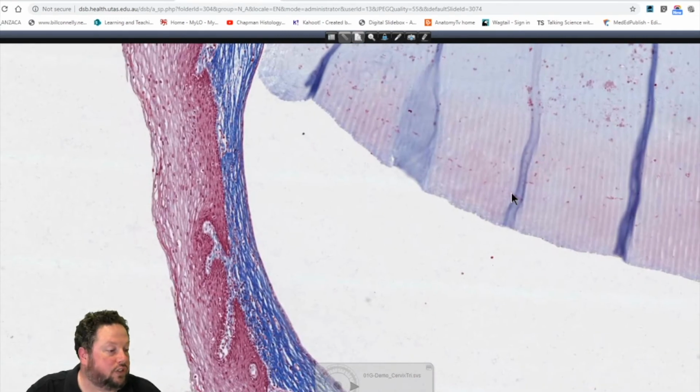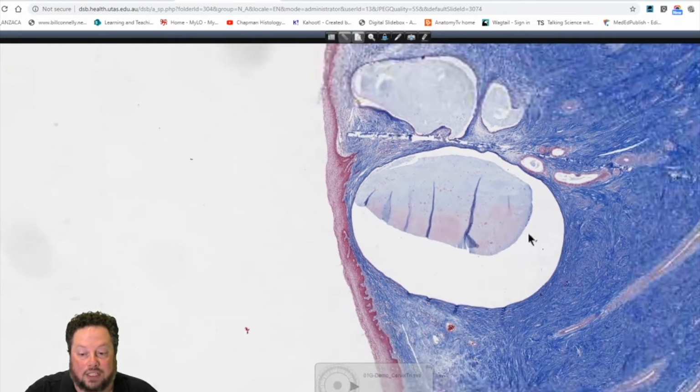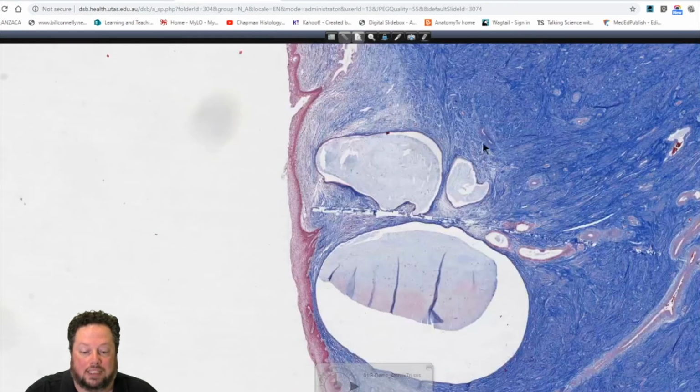Do the secretions rupture out of the cysts, or is it reabsorbed? I think there's probably a mix of both. Sometimes they may rupture. I haven't read a lot about the pathologies that may be associated with the Nabothian cysts, but you can see it is certainly increasing in storage over time. I mean, this one's quite large. If we see a normal endocervical gland here, it's very expanded and relatively large, but I don't know if necessarily that would cause any problems.